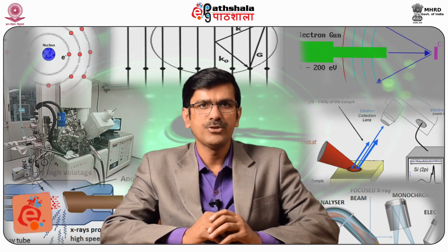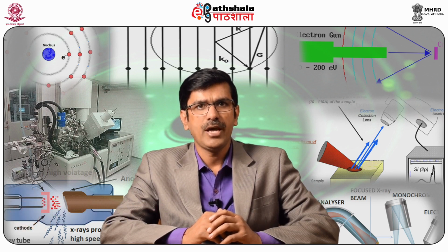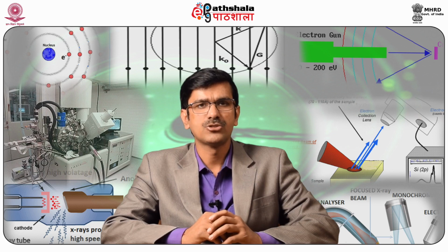Today, we are going to discuss the module X-ray Photoelectron Spectroscopy: An Introduction. This is under the paper of Surface Analytical Techniques 2.